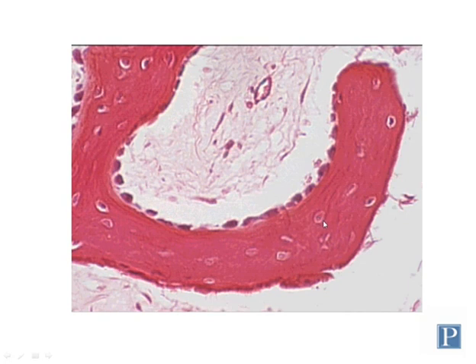So recall that osteoblasts are the cells that are laying down new bone. After they lay down bone, they get trapped within the bony matrix and are found within these lacunae. So osteoblasts on the surface of the bone give rise to osteocytes, which are located in lacunae.